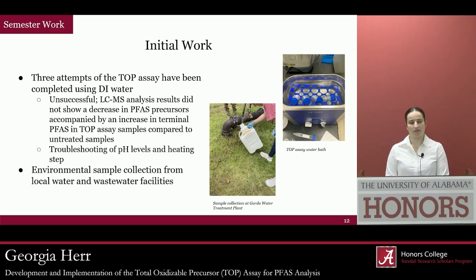For our initial work this semester, we have completed 3 full attempts of the TOP assay and unfortunately have not been successful. Our LC-MS analysis results have not shown a decrease in precursors accompanied by an increase in terminal PFAS in the TOP compared to the untreated samples.